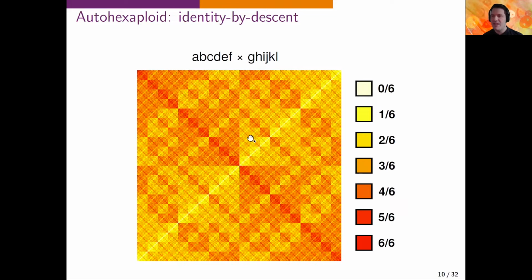From experimental data, we are not so sure about the genotypes of each individual in the population, right? Because we only know the dosage, or because of missing data, or because of errors. So that's why we rely on the genotype probabilities we estimate from the map to find out how related a pair of individuals is.